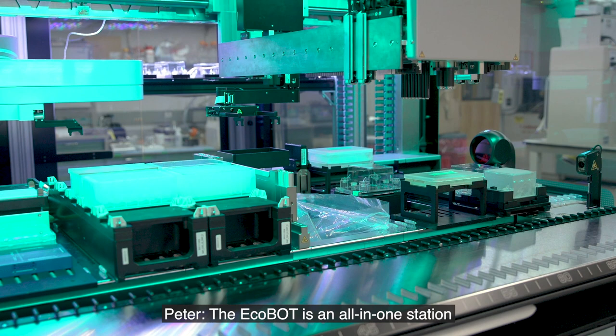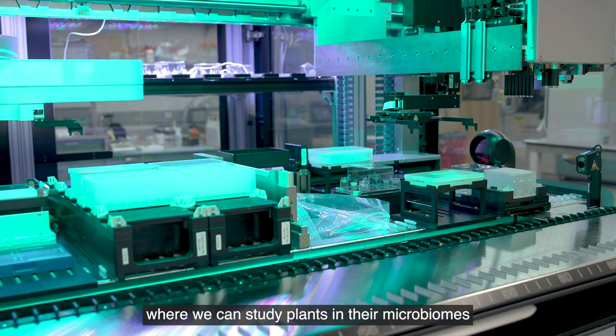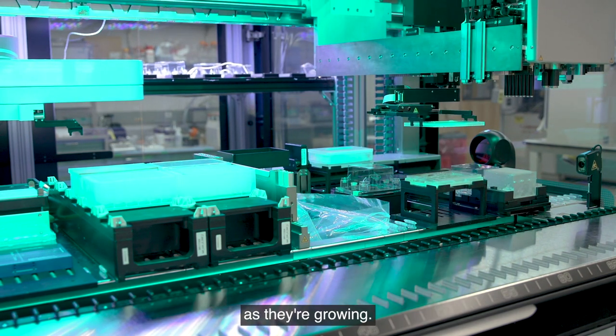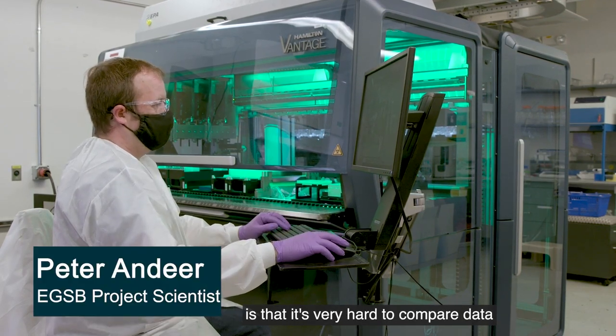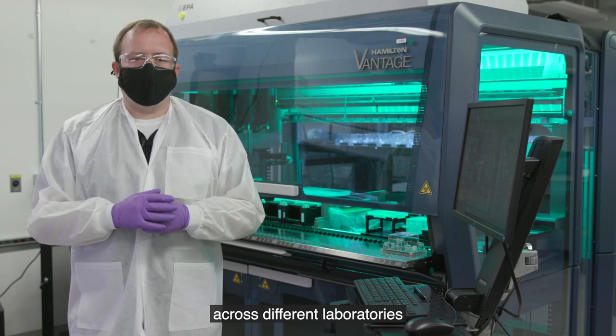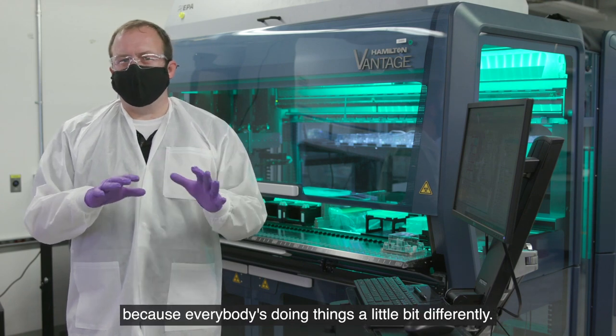The ECOBOT is an all-in-one station where we can study plants and their microbiomes as they're growing. One of the challenges of microbiome science is that it's very hard to compare data across different laboratories because everybody's doing things a little bit differently.